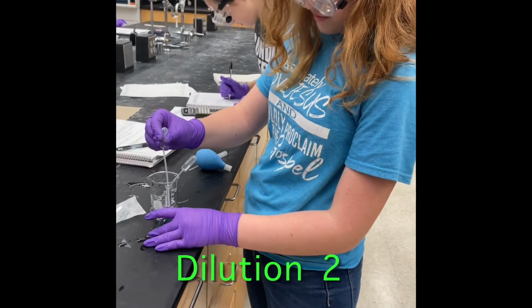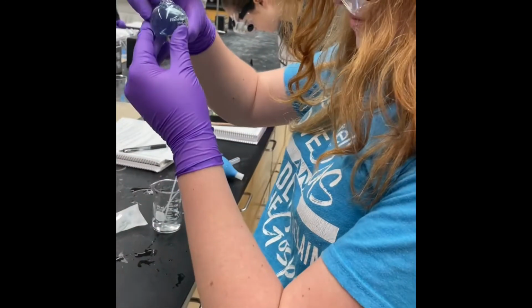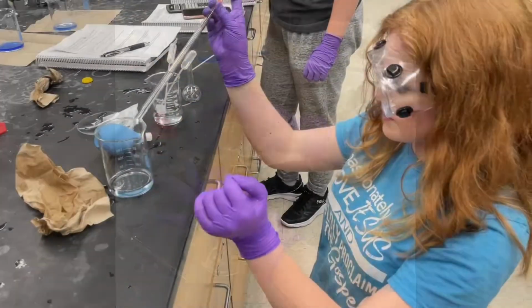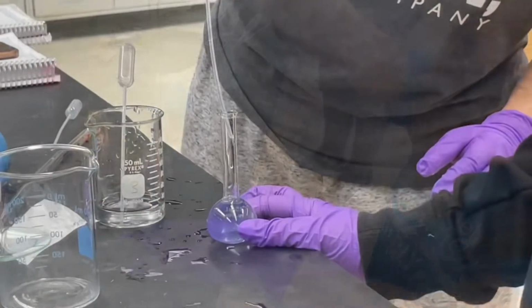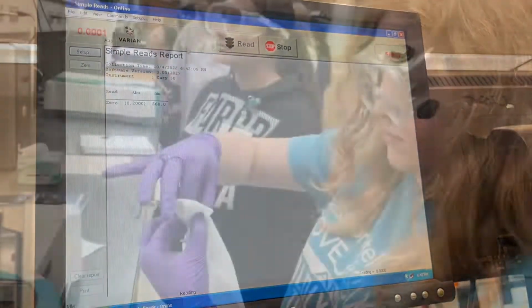To make the second dilution, we added 5 milliliters of the first dilution to the flask, and then we had to add about 20 milliliters of water, and we had made our second dilution. To make the third dilution, we took 5 milliliters of the second, added to the flask, and then 20 milliliters of water to make the third dilution. Then we headed over to the spectrophotometer.